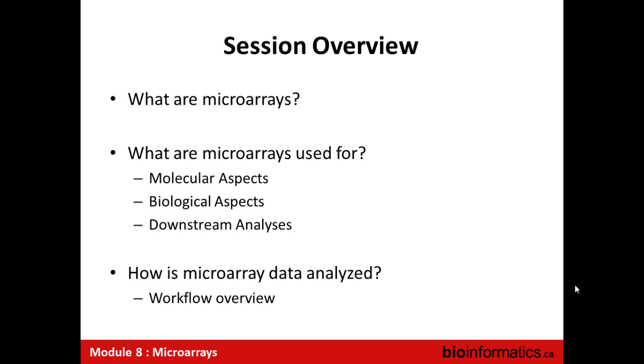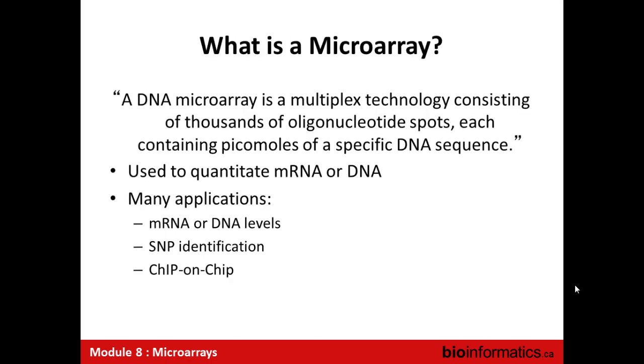We'll talk a little bit about the technologies and a lot about how they're analyzed and what the key steps are that are common to all of the technologies. And then we'll zoom into one particular technique, Affymetrix arrays, which are the most widely used today, and take a look at some of the details of how they're analyzed before looking at that in practice in the practical.